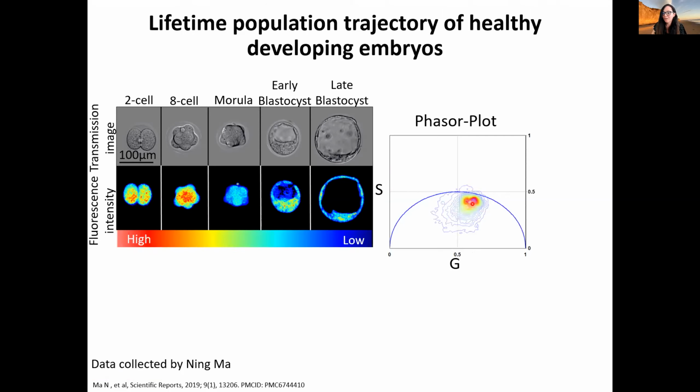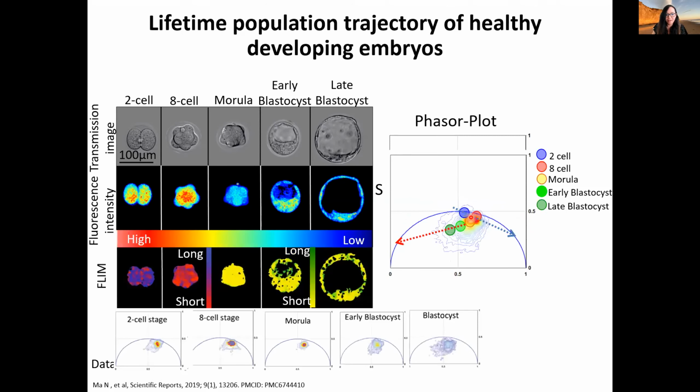And it took us a long time to understand why the lifetime is very, very different than the lifetime of the metabolic trajectory that has been shown by Chiara Stringari and many other co-workers at the LFD, as to the free and bound final lifetime of the pure species of NADH and the presence or absence of binding.